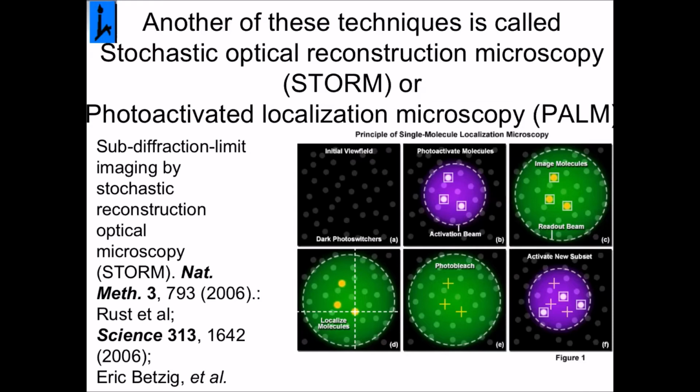Okay, the resolution is very bad in Z. But just like you have a point spread function in X and Y, you have a point spread function in Z. Okay, he's trying to understand that point spread function and then trying to get less out of focus light information to get higher resolution. Okay? That's what he's doing.